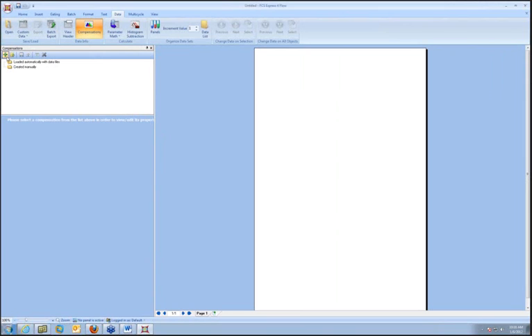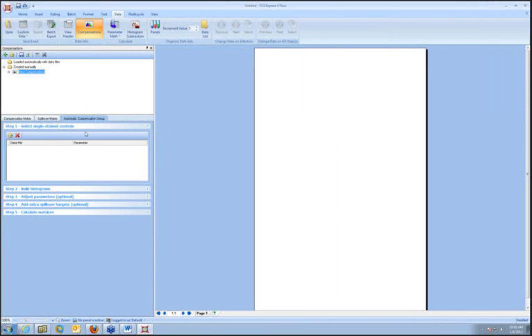And you notice if I just hover the mouse over it, a little hint appears. And I'm going to call this my auto comp. Okay? And you notice when you create your own compensation, the first tab that by default appears is the automatic compensation wizard. And you'll see the wizard is very quick to go through and set up your own comp, much quicker than it was in previous versions of version 4 and in version 3.